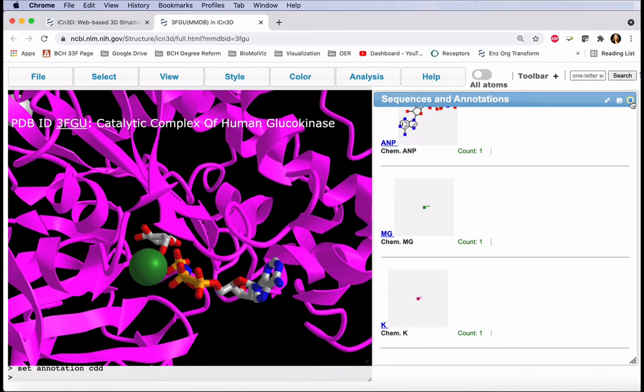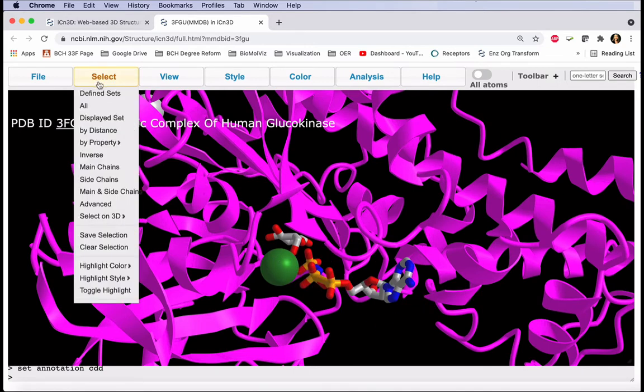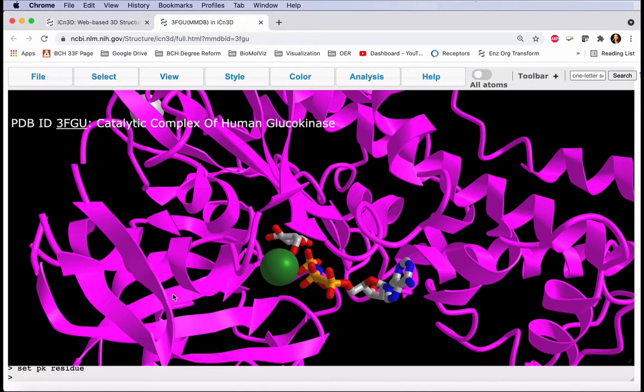Now we can close the sequences and annotations window and select on our structure. Select, select on 3D, and here are the instructions for doing this. This is for a PC. Alt will actually be option on a Mac. Ensure that residue is selected.